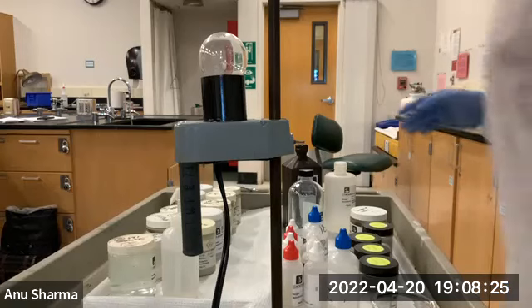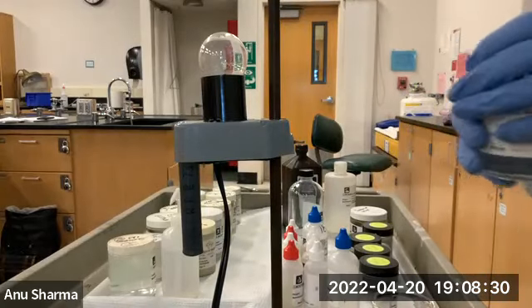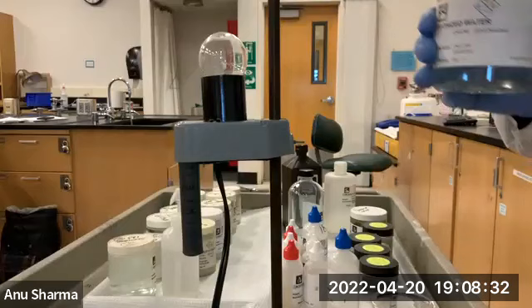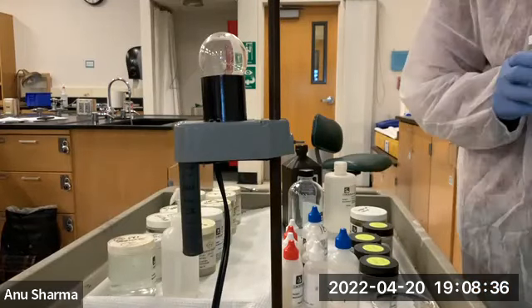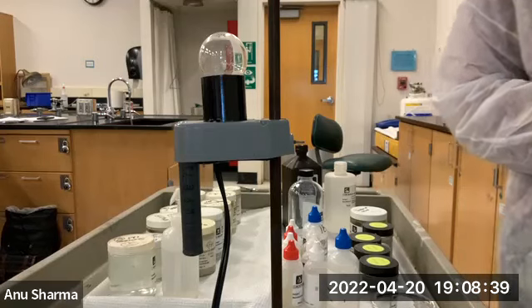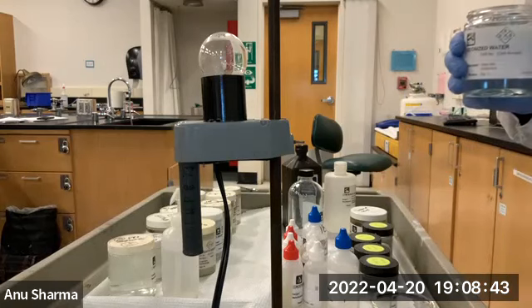Now, the deionized water number 1, what do you guys think? Is it going to ionize or not? If it is ionizing, the bulb is going to light up. If it is not ionizing, the bulb is not going to light up. Or if it's weakly ionizing, you will see a very dim light.